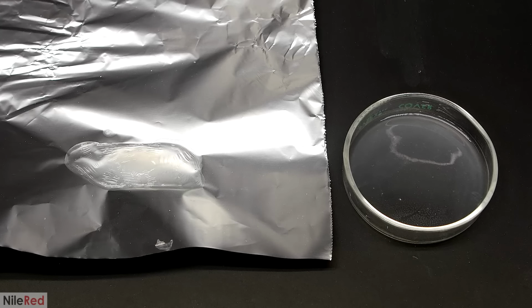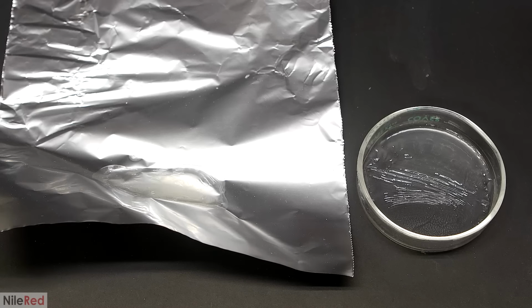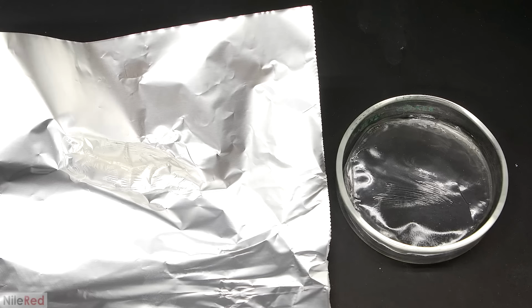What's kind of interesting was that as it evaporated, the cellulose acetate slowly contracted in on itself. It's happening in both samples, but the aluminum foil one is much more evident. Eventually, the acetone was pretty much gone from both of them, so it's time to check them out.